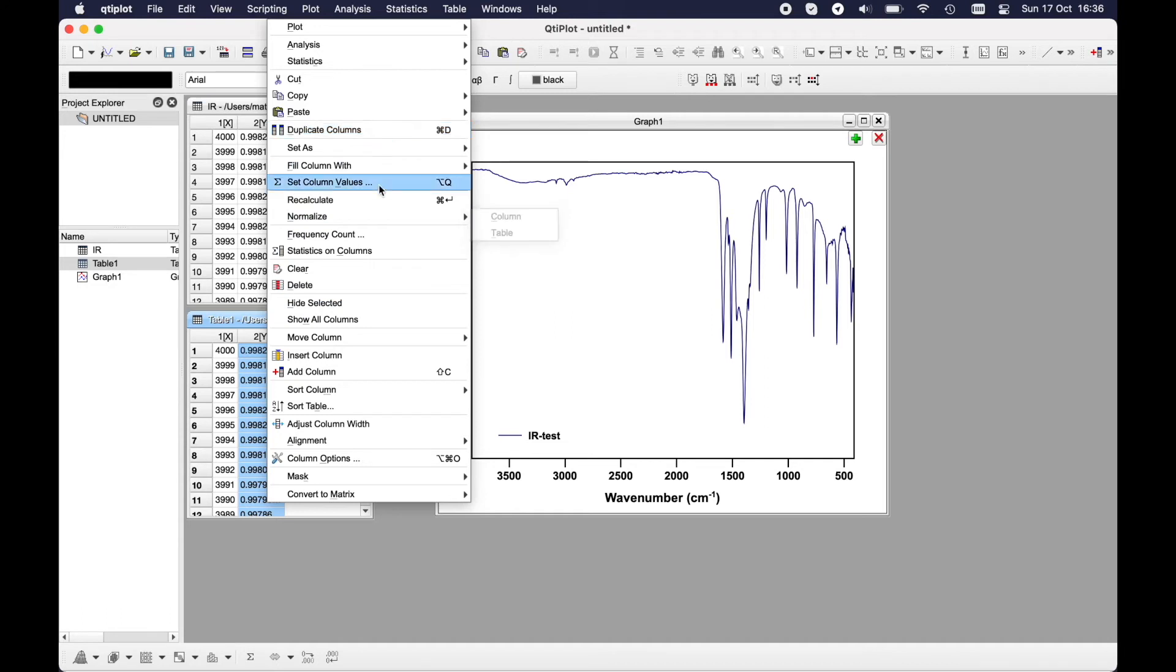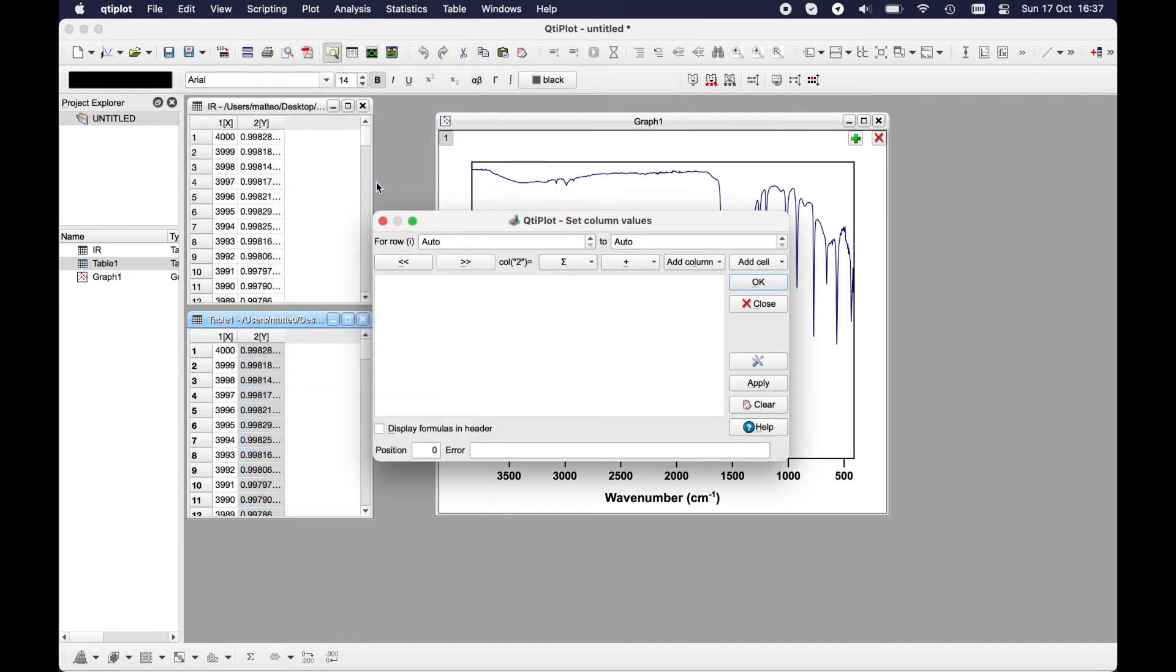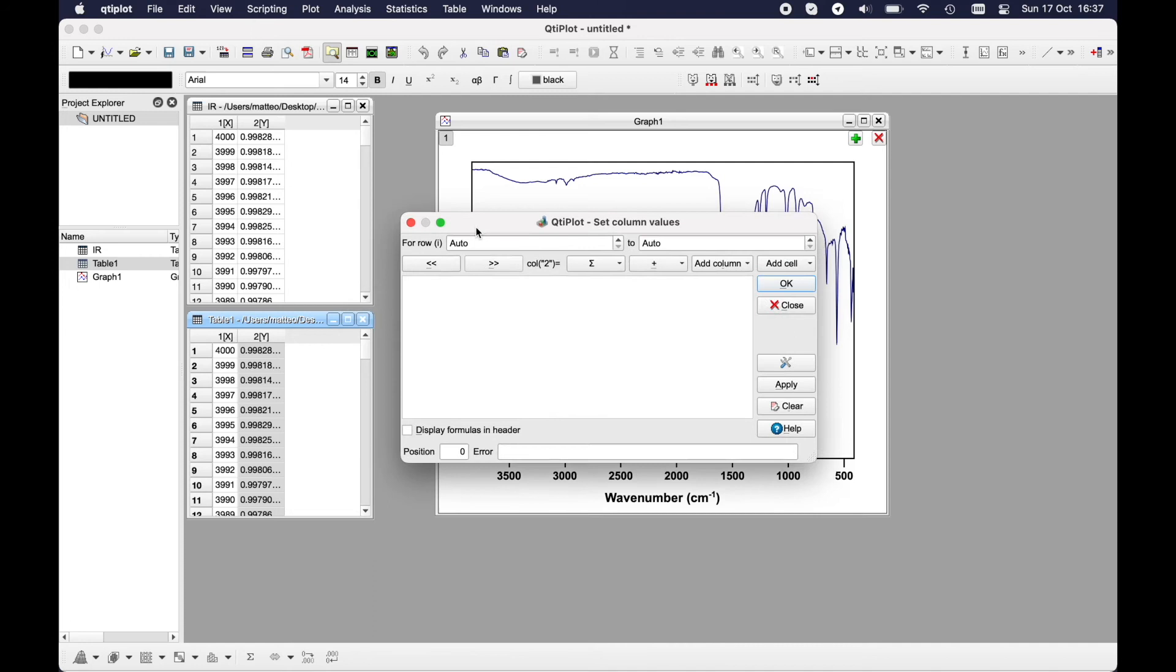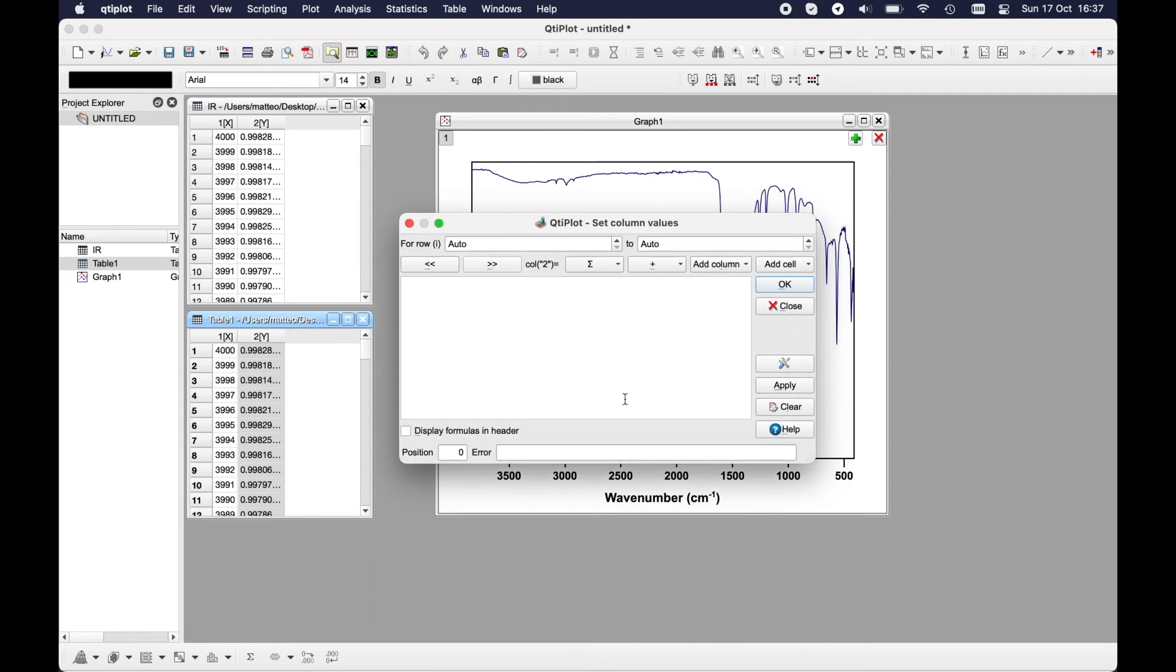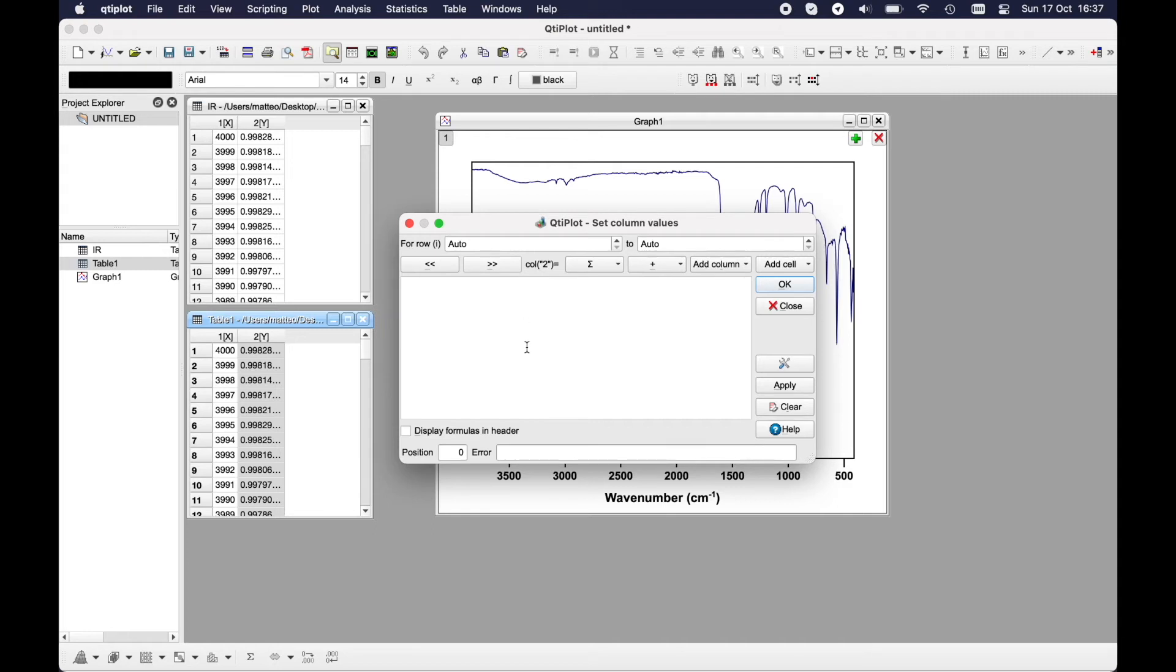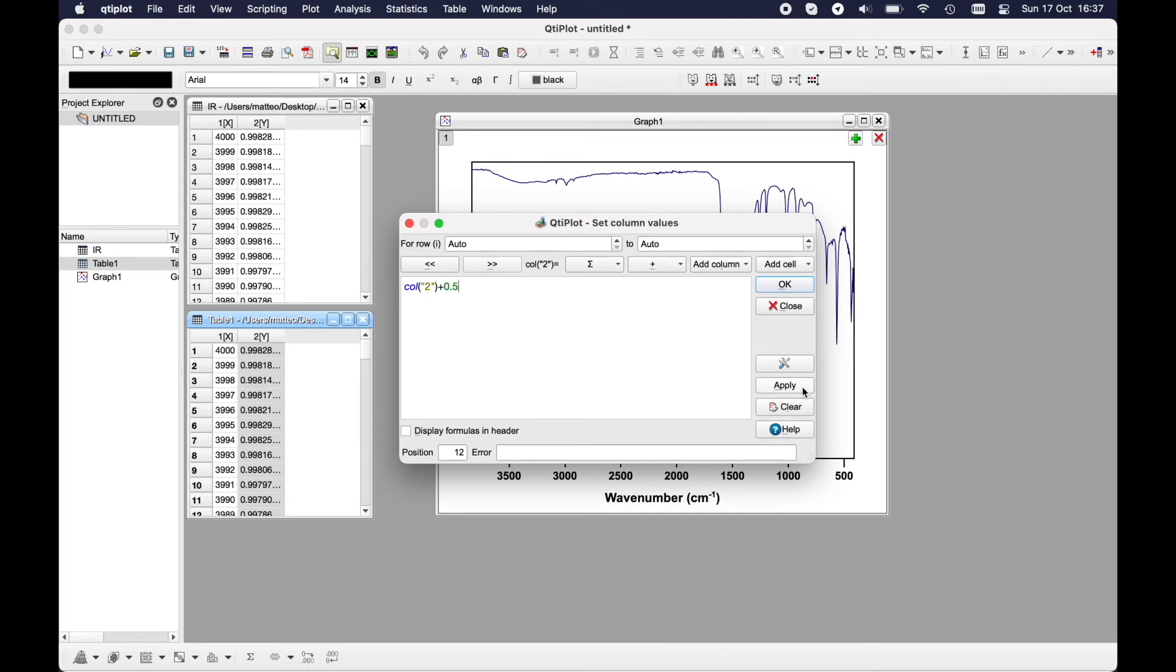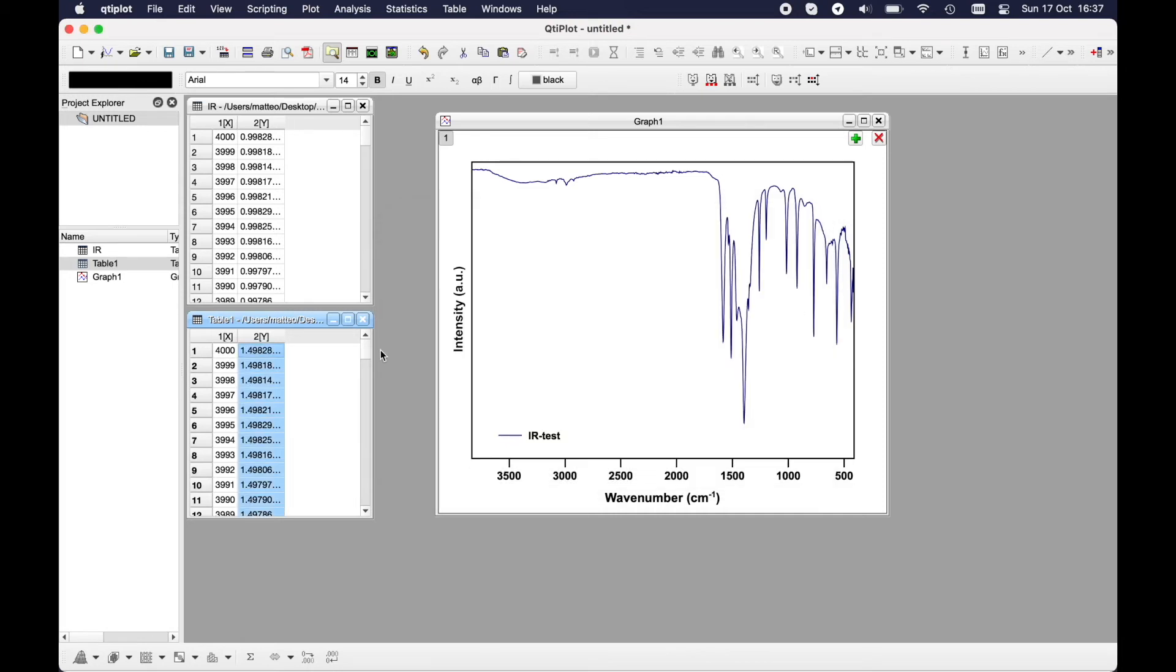Then you would like to put it here but above this spectrum. It's very easy. You have just to go here and go to Set Column Values. Here you will have the possibility to apply equations on this column. I will put it on column 2, so column 2 will be summed with 0.5. Apply and close.